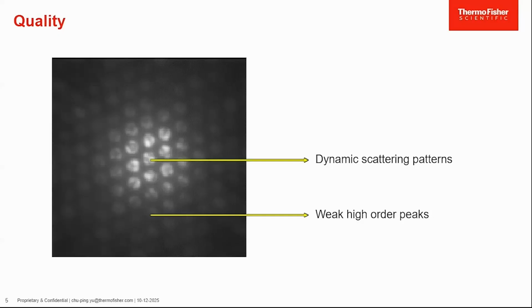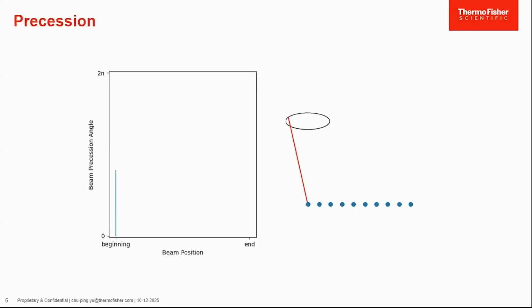Another difficulty is that electrons are essentially quite difficult to scatter at a higher angle. That means all these higher-order diffraction disks are always going to appear weaker compared to the one at the center. So both difficulties will increase error in pinpointing the coordinates of your diffraction disk and also cause error in the final measurement of strain.